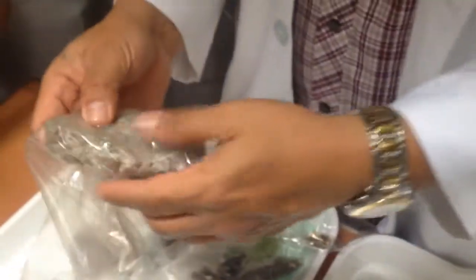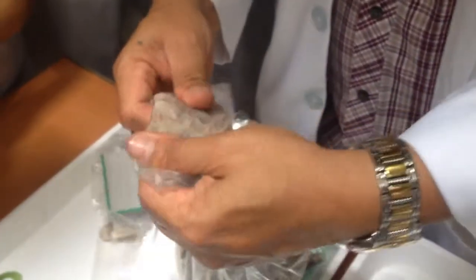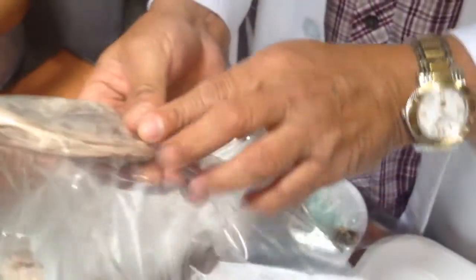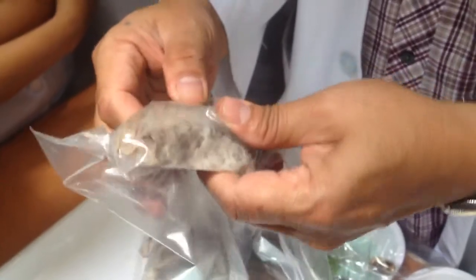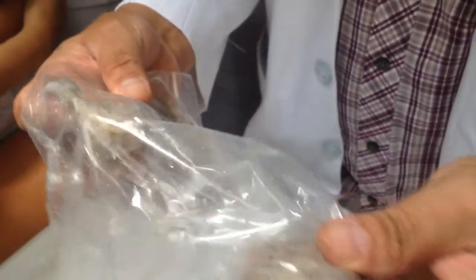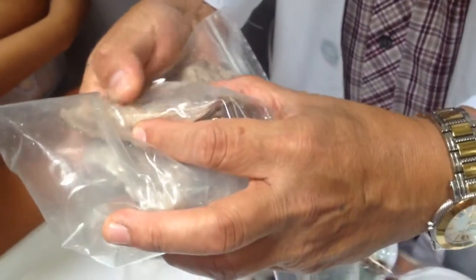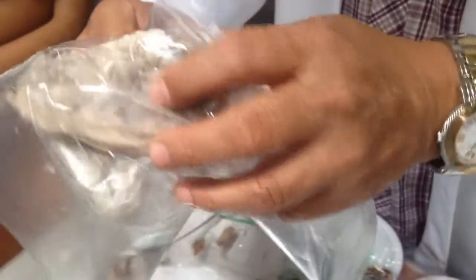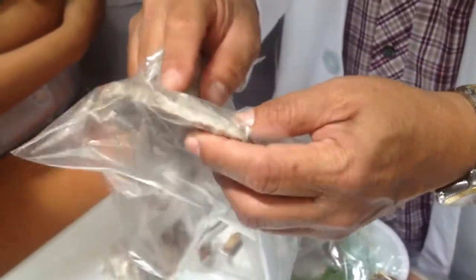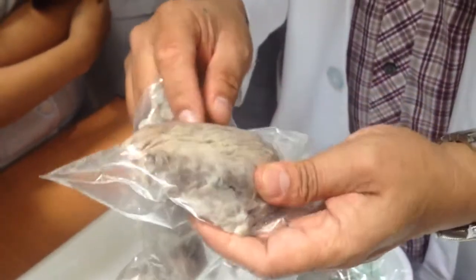So this grossly is meaty-like, similar to your leiomyosarcoma. It will be similar in your breast and in your uterus. So notice that the fibers are more elongated. Okay. So these cavities are areas of necrosis plus hemorrhage.